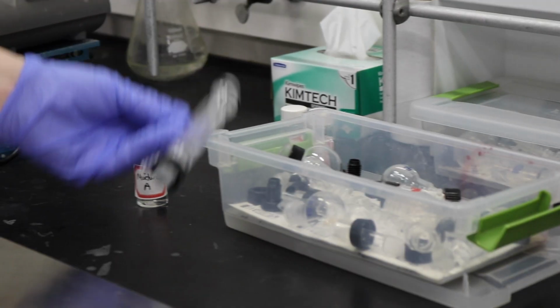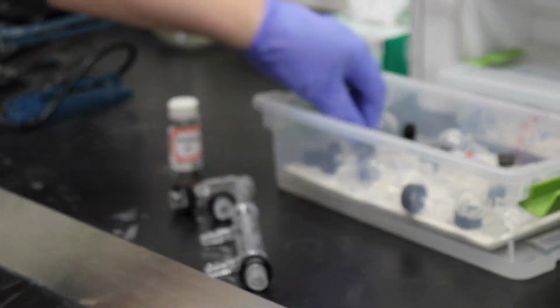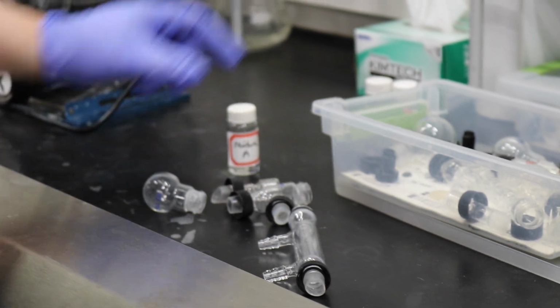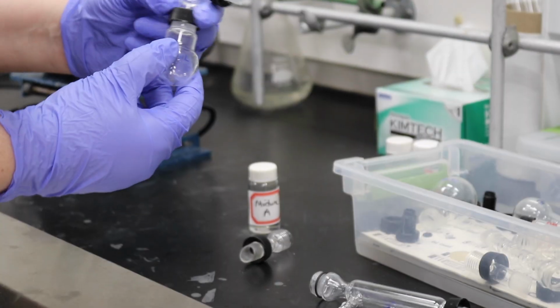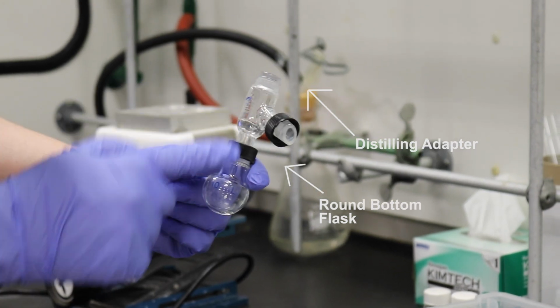First, we're taking out our condenser, then our distilling head, now our thermometer adapter, then our round bottom flask, now our bent adapter. We're putting our round bottom flask together with our distilling head. As you see here, we're assembling our system.